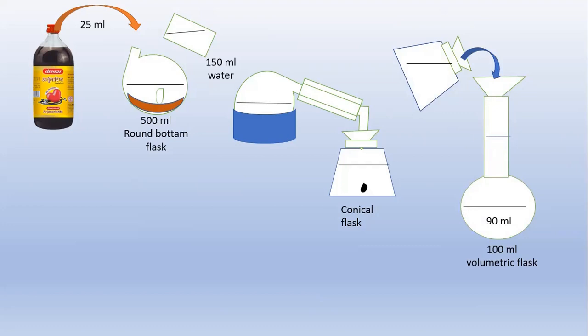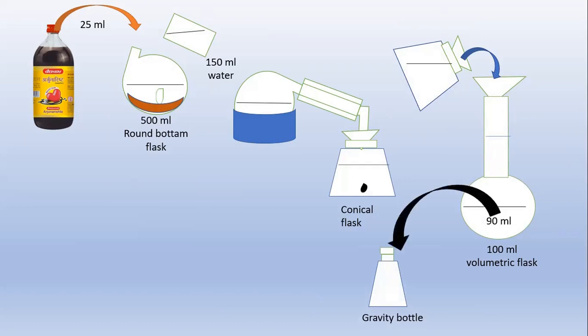The mixture is then mixed thoroughly and transferred into the specific gravity bottle. The specific gravity bottle procedure involves first taking the weight of the empty gravity bottle, then transferring the contents into the gravity bottle and placing the lid.